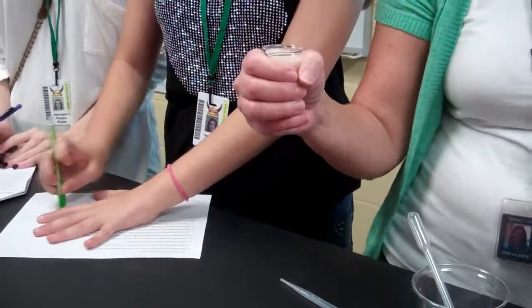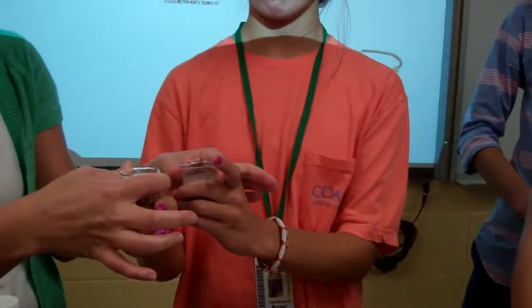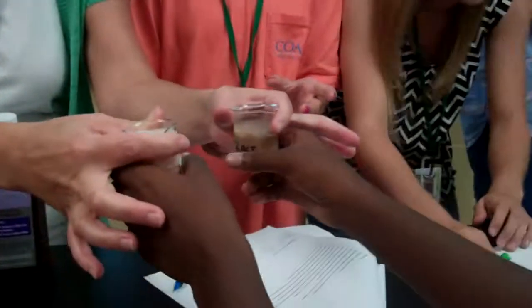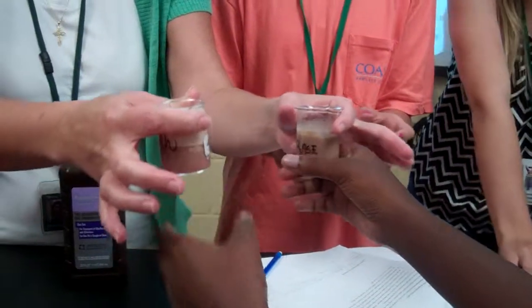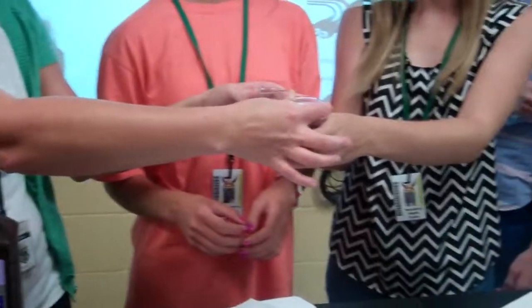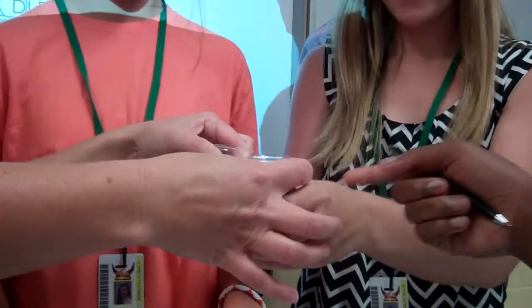Alright, so I'm going to let somebody hold this, okay? Because I want you to feel the difference between one that has a reaction happening and one that doesn't. Is it warmer on the reaction? How does it feel? The same. Somebody else. This one's warmer. You want to try? Warmer. Yeah, that one's warmer. This one's supposed to be warmer.